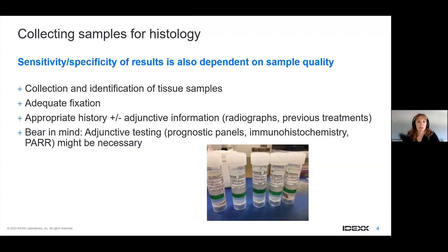As a general consideration, we are working together. I always see us, as a pathologist, either clinical or anatomic, as a team with every one of you, every clinical veterinarian. We're really trying to work together to get the best outcome for the patients. Whether you get a good and really helpful result depends on us, but it also depends on the sample quality and the information that you provide. So it's always a good starting point to have really good clinical information.